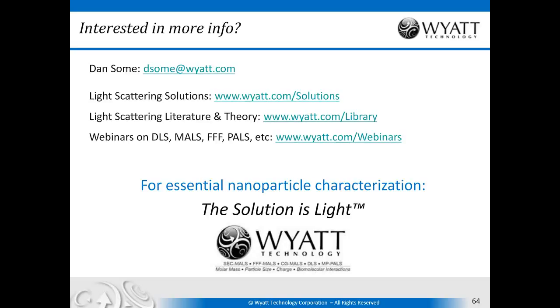Then the light scattering will measure the change in molecular weight, change in size. So if you have aggregation, or more particularly in the example that we looked at, you have some type of dissociation due to that additional reagent, that will impact the size. You can measure size through multi-angle light scattering. Simultaneously, you can measure through dynamic light scattering. And that combination will give you lots of information on how exactly and at what rate the degradation occurs.